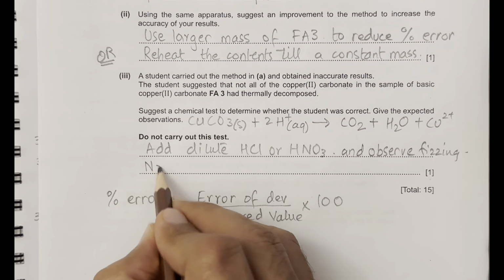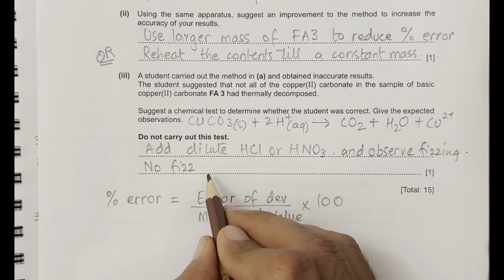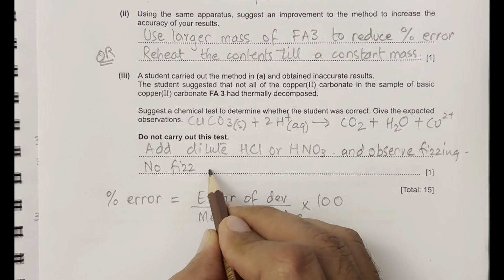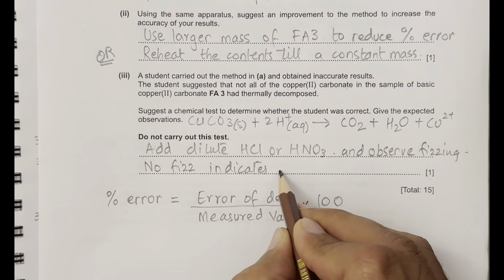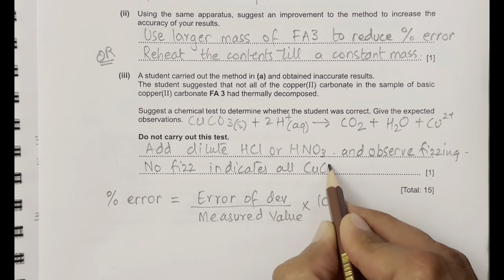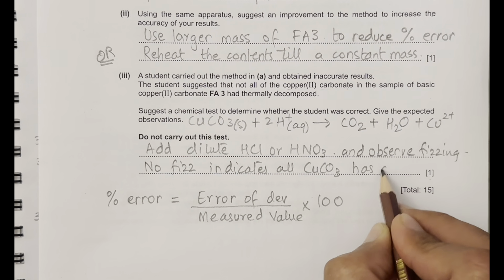No fizz if the copper(II) carbonate is completely removed. It means no fizz indicates all copper(II) carbonate has decomposed.